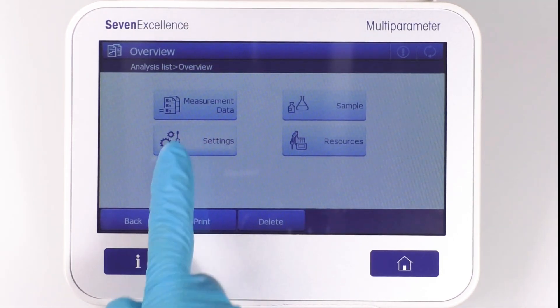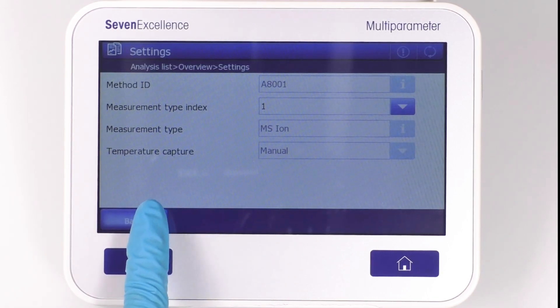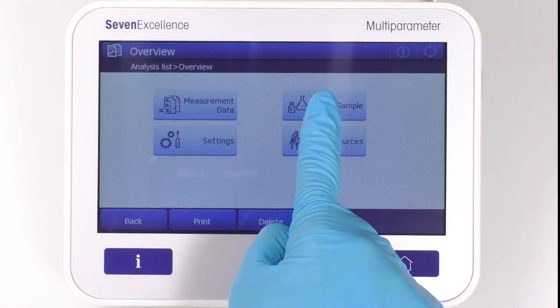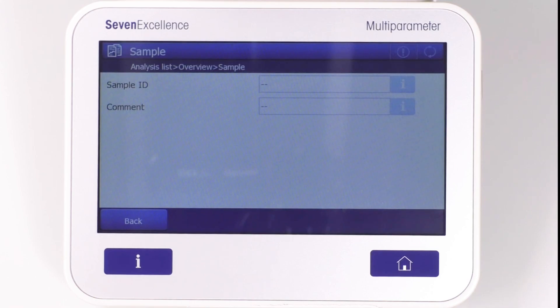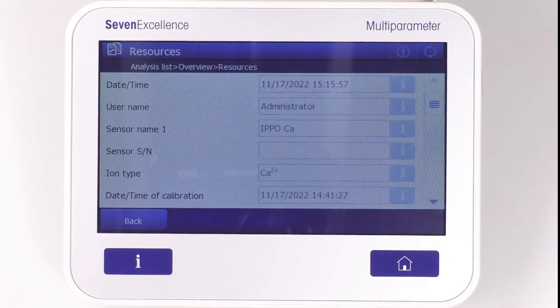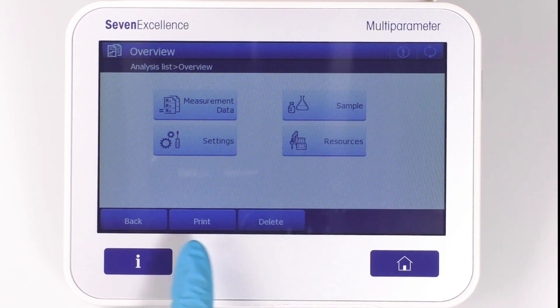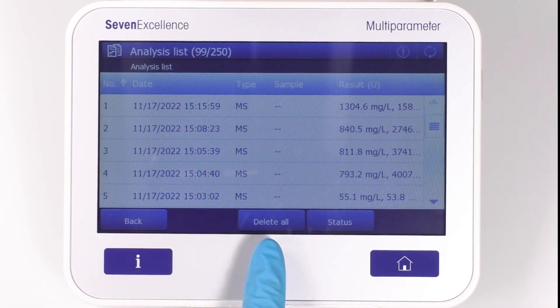If you click on Settings, you'll be able to view method ID, measurement type, and temperature capture. When you select Sample, you'll see the sample ID, and under Resources, you can find all the information you need regarding the equipment used. From here, you have the control to reprint or delete individual results, and it's even possible to delete all data at once.